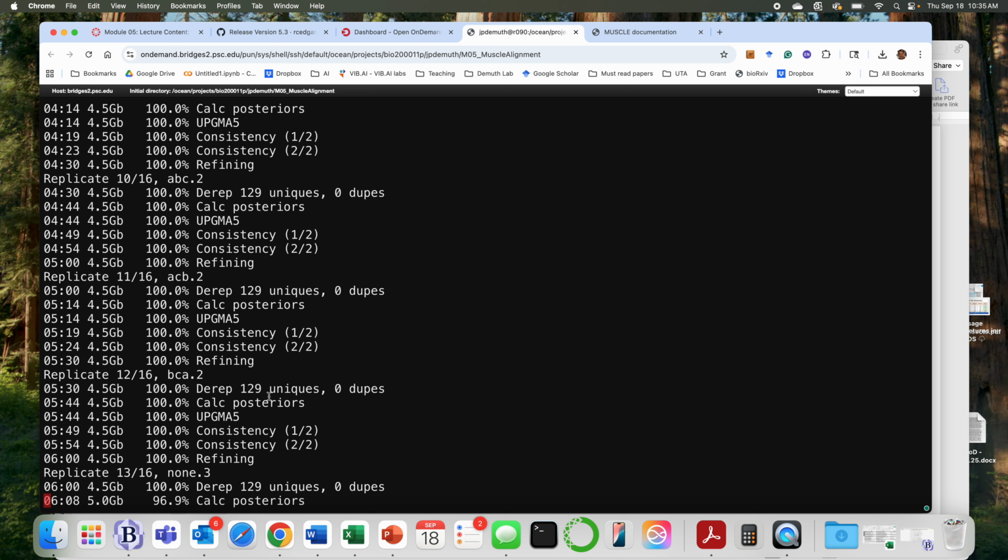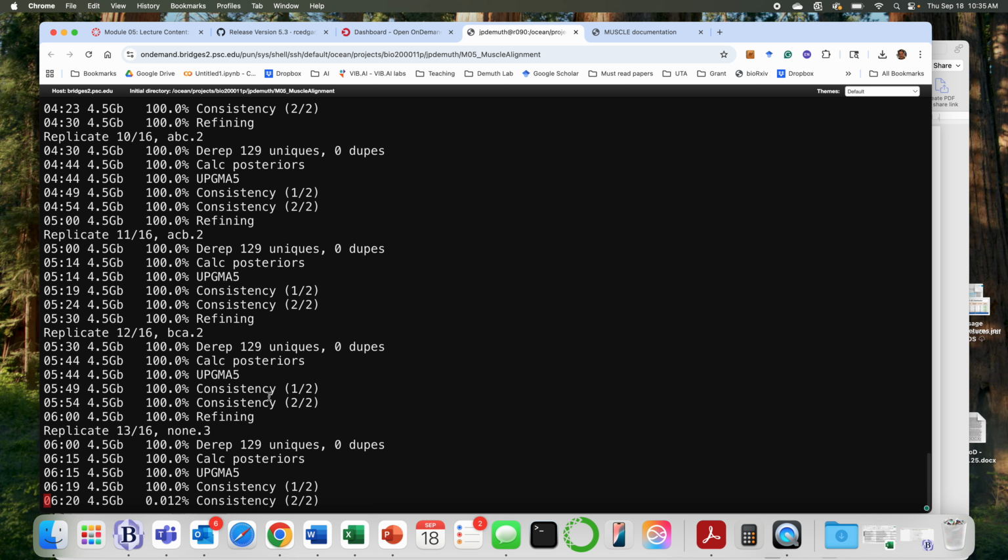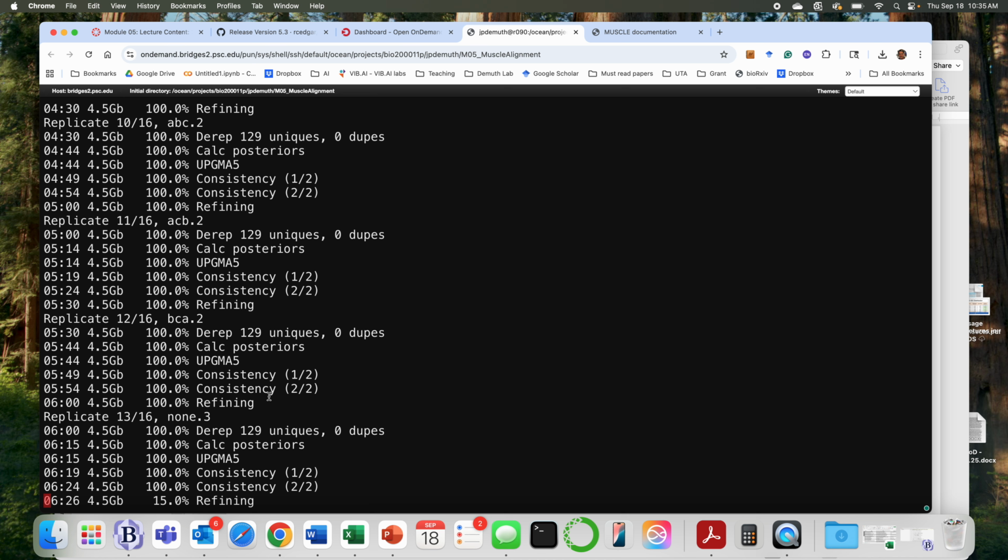What do you want to align? I'm aligning the segment, right? That's the program that's doing the aligning. Okay, so then I would say it's the P450. I'm just going to change that, so where it says C, that's what I'm doing.